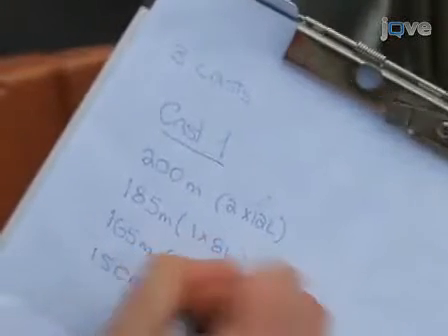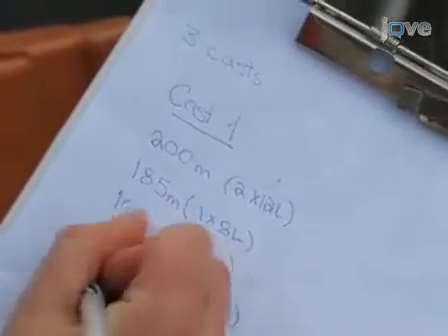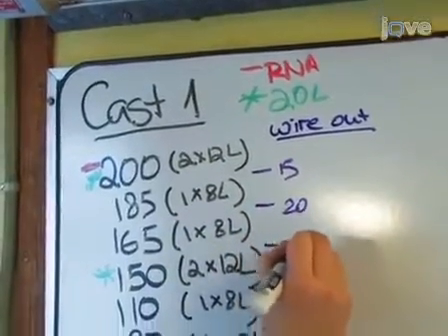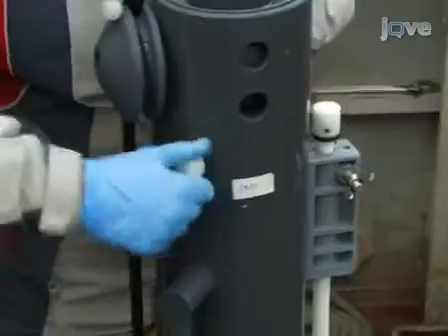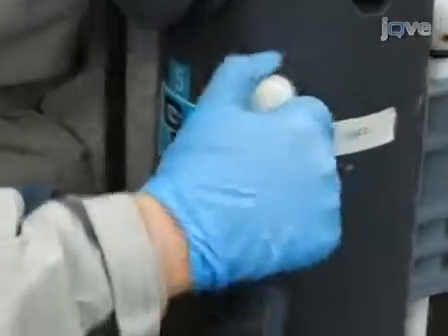First, the number of casts and depths in each cast are assigned. Then, depths to be sampled and the total volume to be collected for the current cast are determined. Ensure that the GoFlow and Niskin water sampling devices are in the open position and that all valves and spigots are closed.